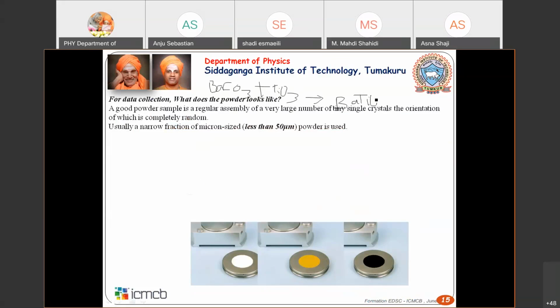Okay, and then there will be some products like carbon dioxide and all those things. So we don't worry about the byproduct because this will escape into the atmosphere at high temperature. Okay, so first thing what you do is you try to have a, sorry, this is O2.